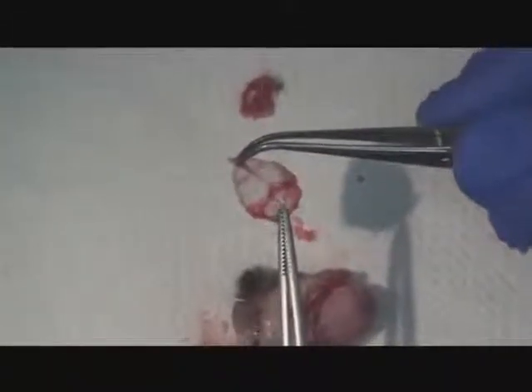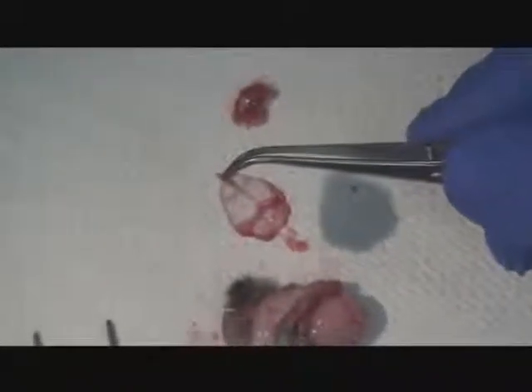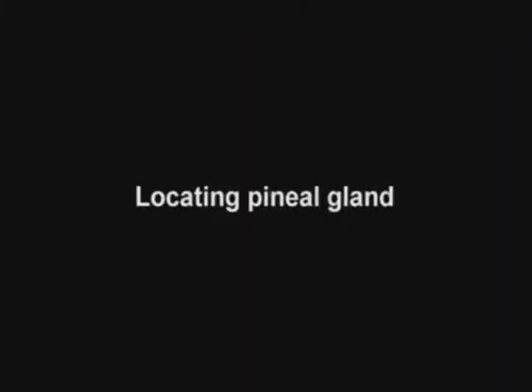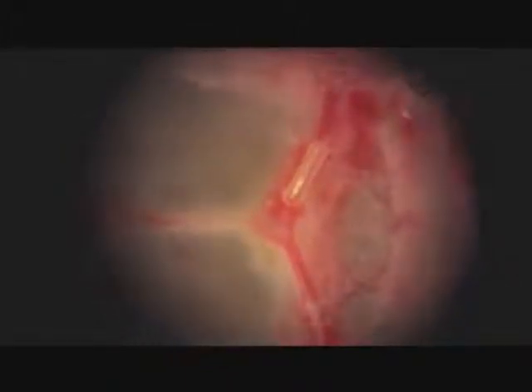The confluence of those three lines is where the pineal gland is. If we're lucky, the pineal gland is in the skull cap; if we can't locate it, it's probably back in the brain and hard to get. The skull cap should be placed in cold PBS inside a petri dish, so you can see it floating up at the viewer.